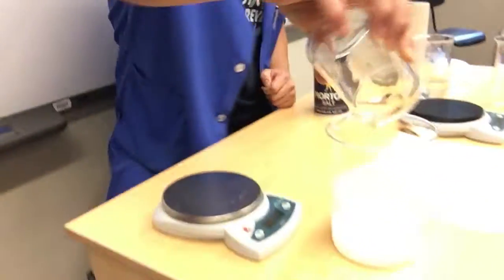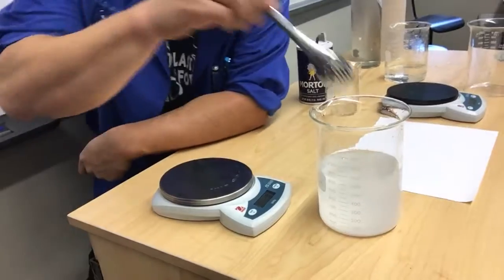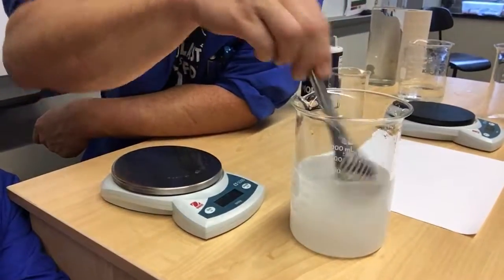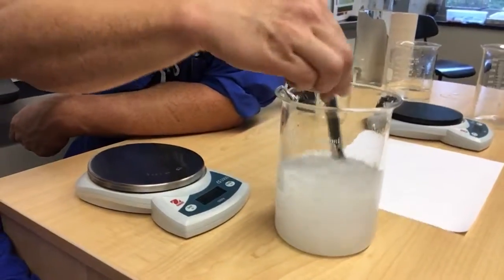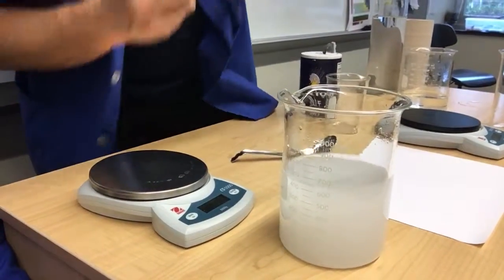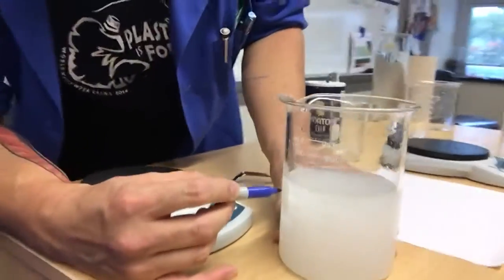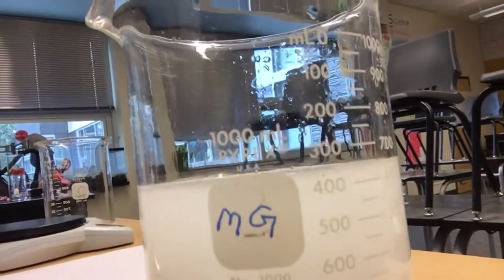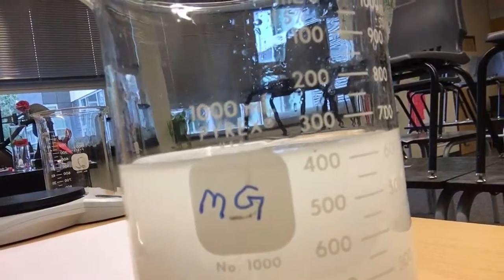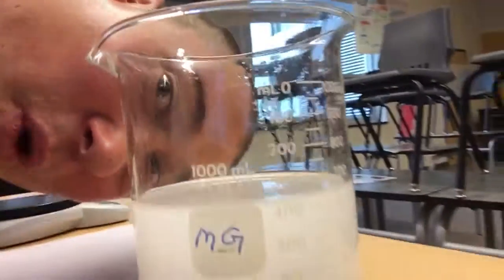And then we're gonna do just what we did in class. We're gonna dump this salt in here. And as you can see, it probably looks the same as you saw it in class. It's kind of opaque. We started with a clear and colorless liquid, and now we've got kind of a milky looking thing. Let me get a marker and I'm gonna mark this with Mr. G's initial. Mr. G. There we go. And you're gonna see that this will change by tomorrow. It won't look like milk anymore. So whatever Mr. G's showing you right now, you're gonna have to tell him why it looks like this.